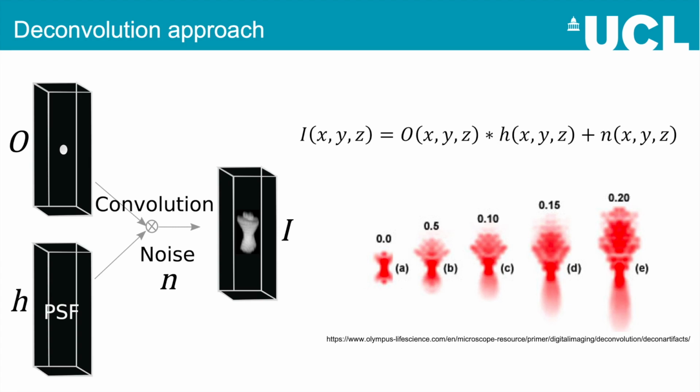Now, what I'm showing here are point spread functions achieved by a computational model with different refractive index mismatches. So for a computational model approach, you need a number of parameters of the imaging system as well as the sample. And whilst these models provide very effective estimates, the difficulty that we have is that because we have a serial sectioning block facing technique, we're not like other imaging systems. So in more standard imaging systems, you have contamination of the focal plane by light from both above and below. Because with serial section imaging, you're physically removing any sample above the imaging plane, you don't have this contribution anymore. So your point spread function is highly asymmetrical. You can think of it kind of like this in effect, where you cut off one half of your point spread function. And this means if we want to use this mathematical approach to estimating the point spread function, we need to alter these models slightly.